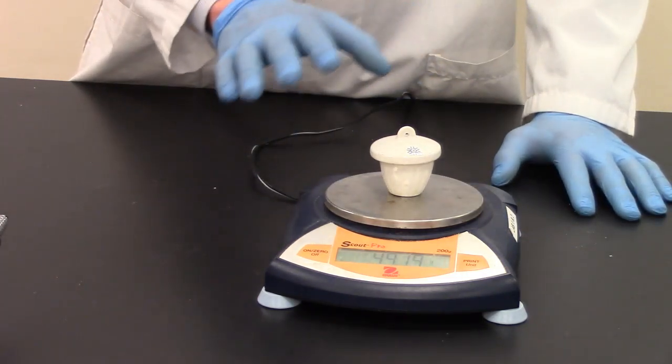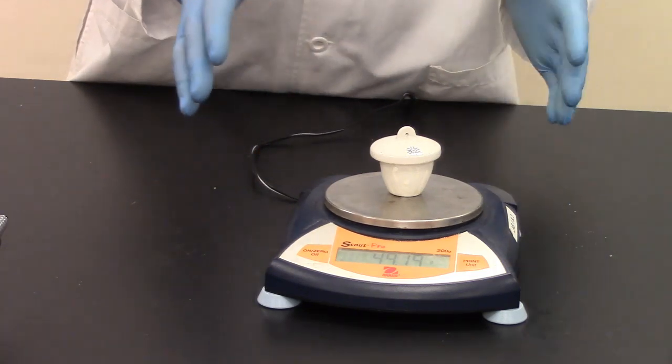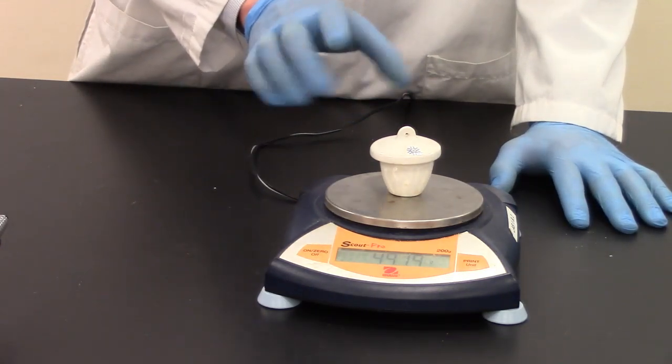So we have a mass of our reactant, the sodium bicarbonate, and the crucible. We have a mass of the empty crucible. You should be able to isolate just the sodium bicarbonate by itself.